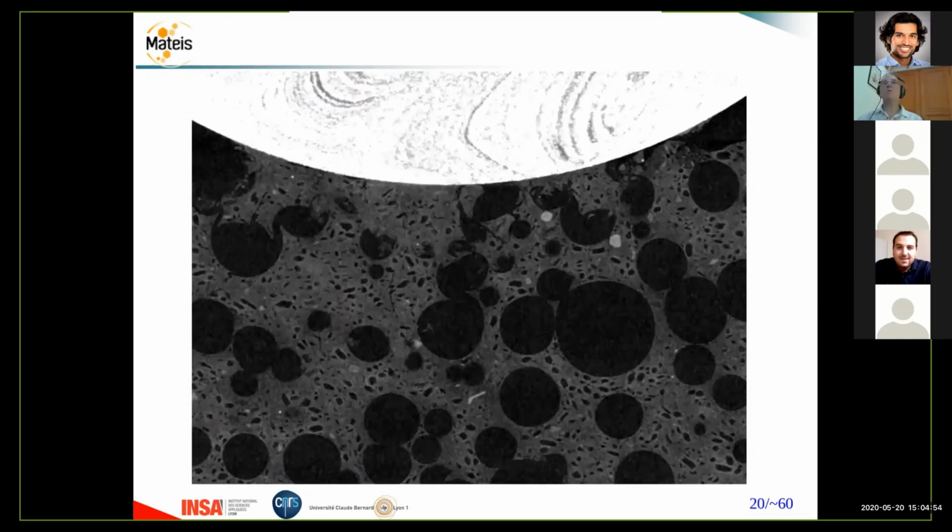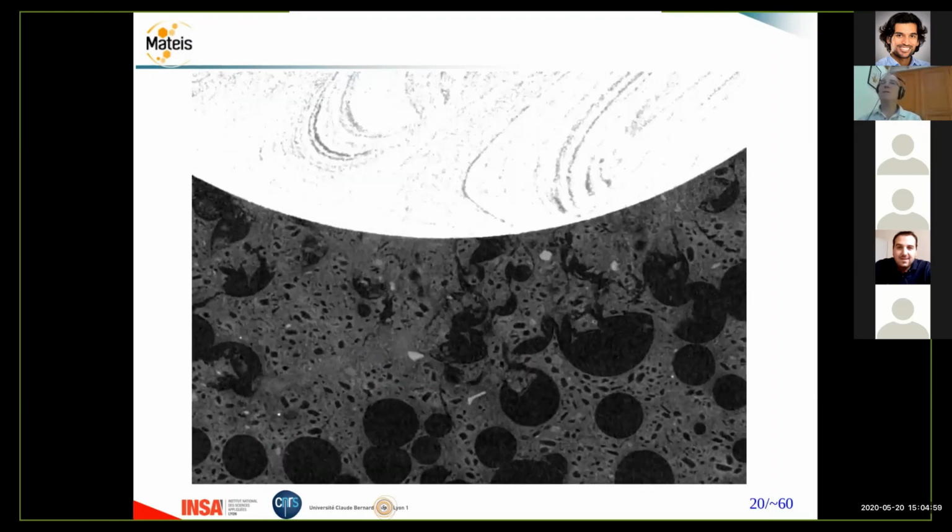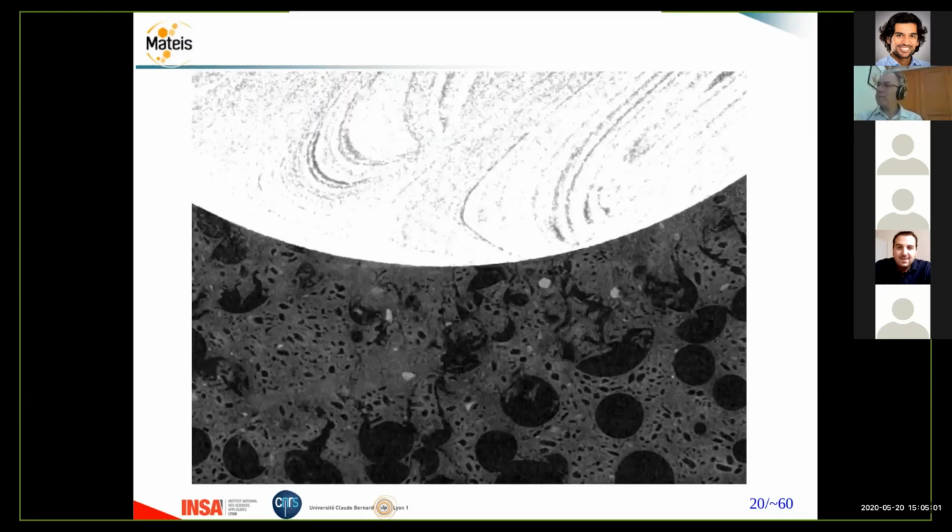Oh, okay. So possible to elaborate on this? Oh, yeah, sure. And the second question is, for example, the choice of the number of steps to be able to perform DVC also in this indentation test. Thank you. So both, in principle, you could probably anticipate in a clever way.